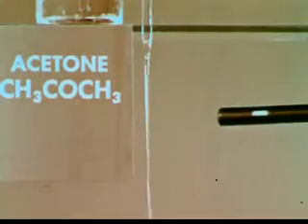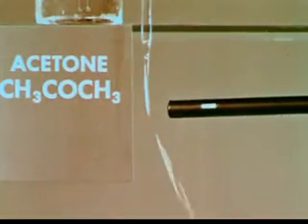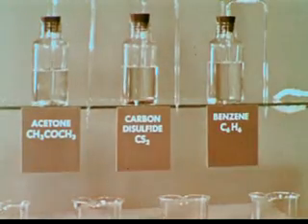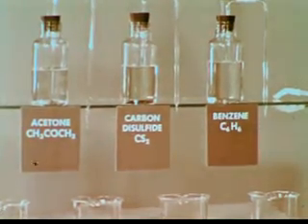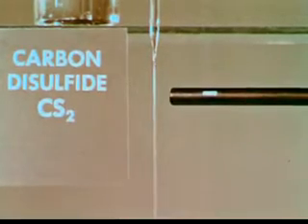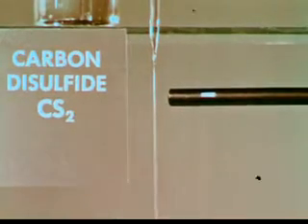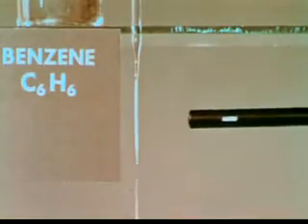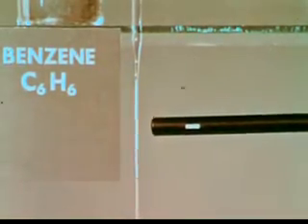Here is a stream of acetone. It too is attracted. Let's try the other liquids, carbon disulfide and benzene. The charged rod does not attract carbon disulfide. Nor does it attract benzene.